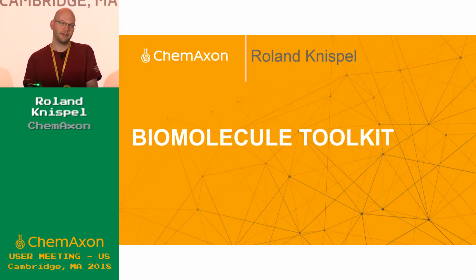The next thing is a little bit out of place because it doesn't really relate to Marvin.js yet. It's an add-on to BioEddy itself where we're saying, hey, when you have the ability to draw and define those molecules, what are you going to do with those? And just as we have in the chemistry world, JChemBase is the main engine for chemical data representation, the database layer, and the ability to search on these.